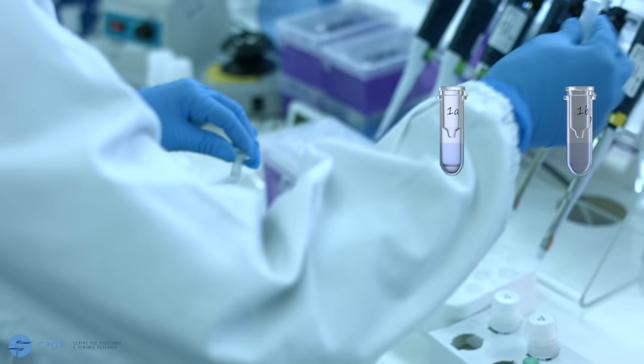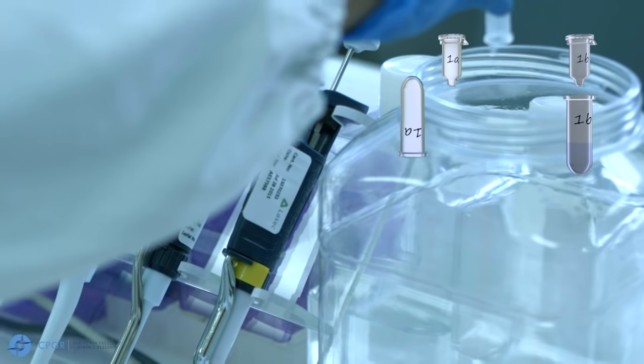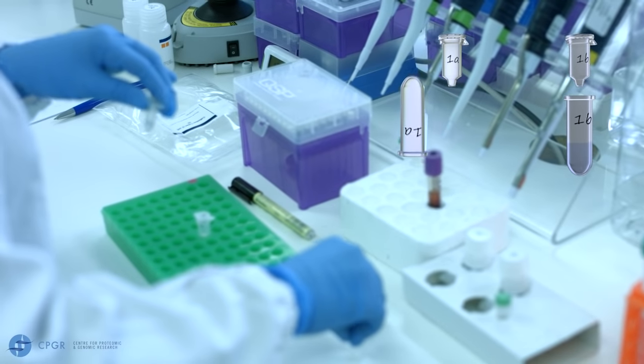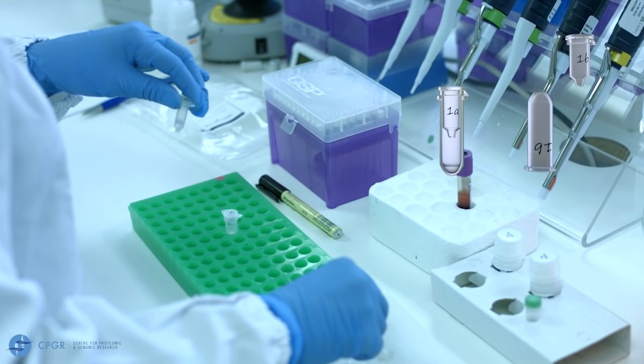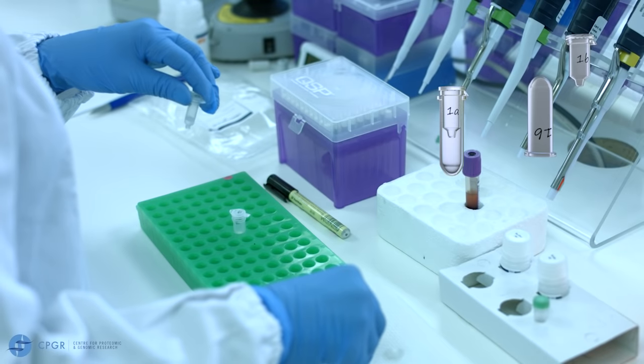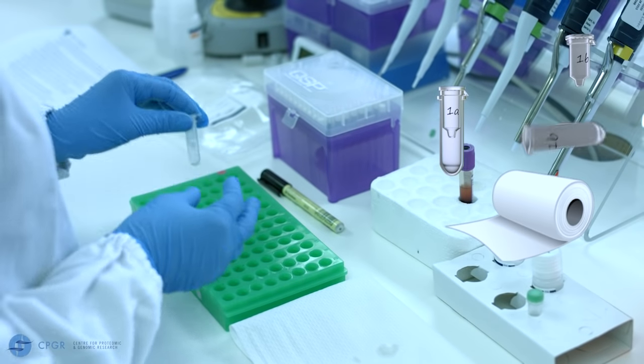Discard the filtrate from the collection tube into a waste container as the collection tube is going to be reused. Dry the rim of each collection tube on a paper towel and replace the spin column.